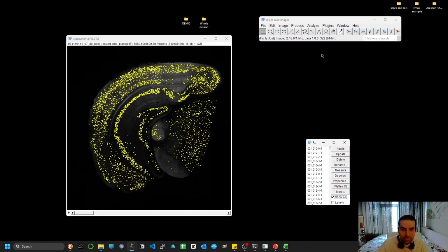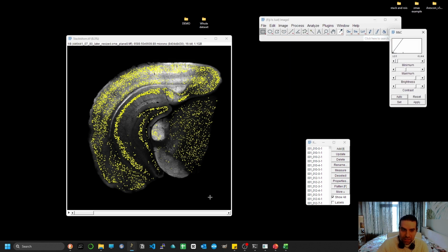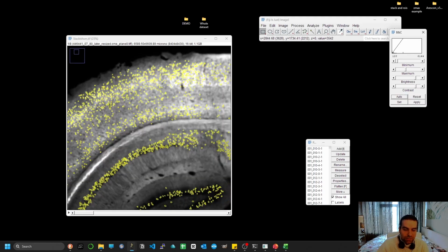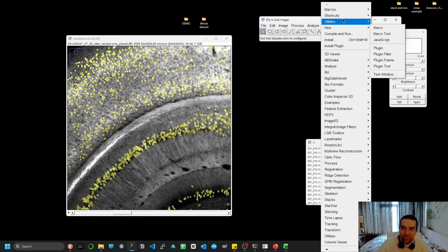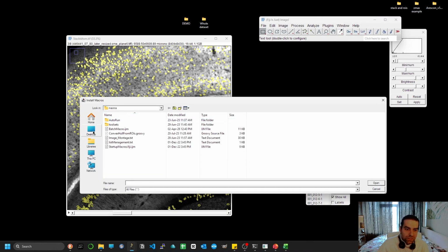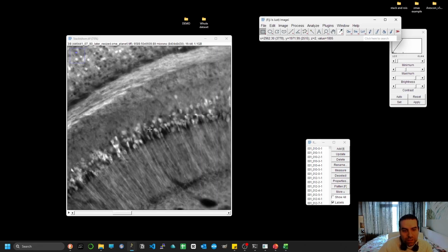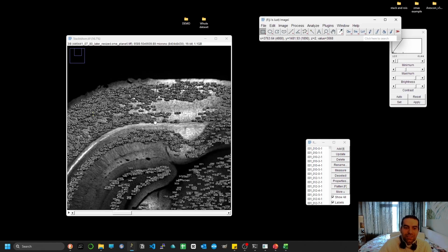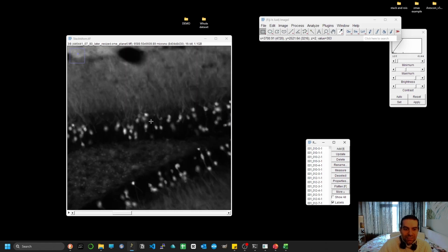And it's quite interesting to see the Z axis as well. So if I try to come here, I'm also going to install a plugin that will make my life much easier in terms of visualizing. I have this show all file that allows me to turn on and off the regions of interest. So these are all the final detected regions of interest in your file, and let's use our real ROI names as labels, and let's have a look.